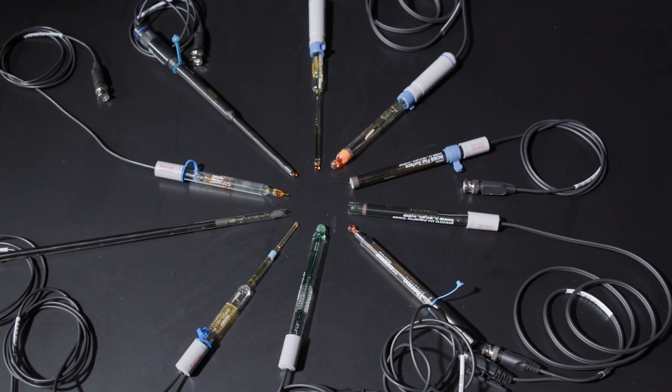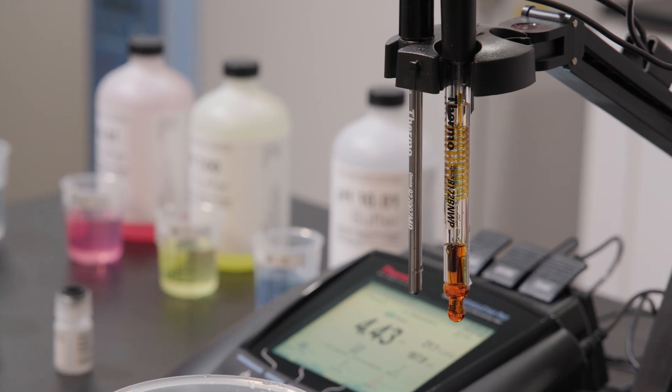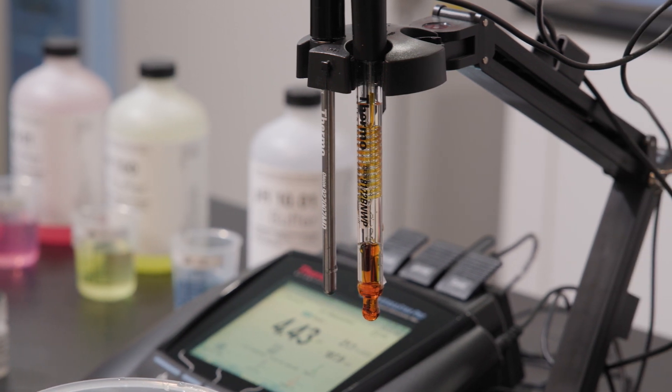The key to accurate pH analysis is using the correct electrode. Because there are so many options, it's often hard to know which pH electrode is right for your application. You may have an electrode type that you've used for years, but is that the best choice for your sample?